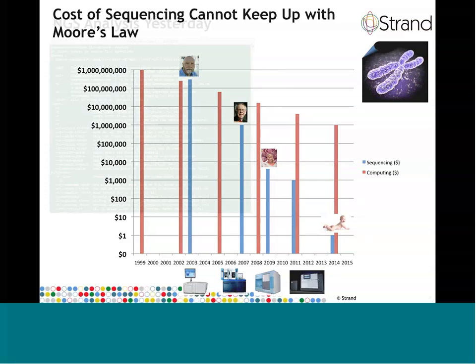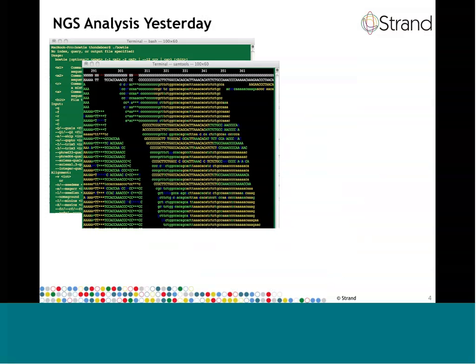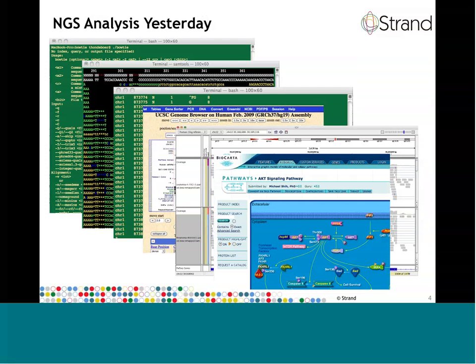But in order to get answering these biologically relevant questions, many researchers find themselves having to deal with esoteric command line applications, many of which require extensive knowledge of computing environments that have basically not developed since the 60s. And to get to the underlying biologically relevant information, a researcher often finds themselves jumping from one program to the next website and back again, which often is accompanied by data translation steps and file format changes. But many biologists did not go into biology to become bioinformaticians, but they wanted to do real research.